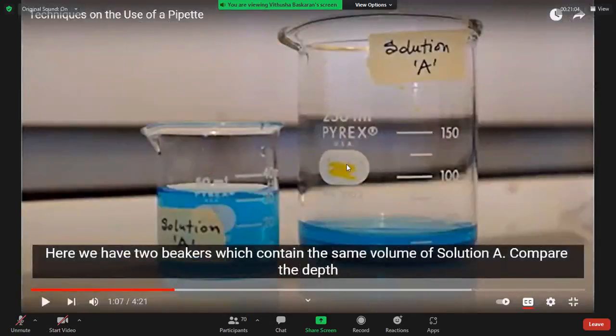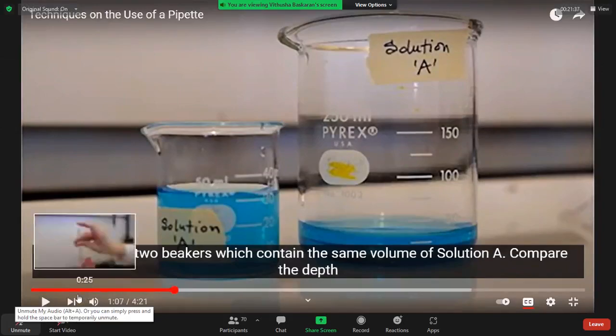So for taking 30 milliliters, will you use a 150 or 500 milliliter beaker or a 50 milliliter beaker? The volume is 30 milliliter. So will you use 500 milliliter or 100 milliliter beaker or 50 milliliter beaker? 50 milliliter beaker. Then only the depth of the solution will be high. Then it will be easy for the uptaking of the solution.